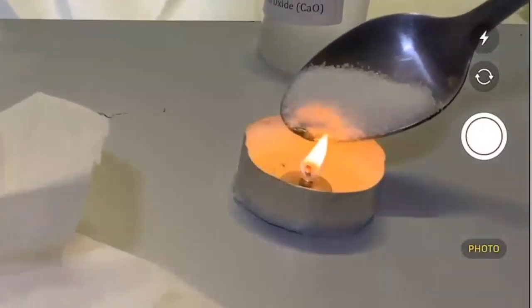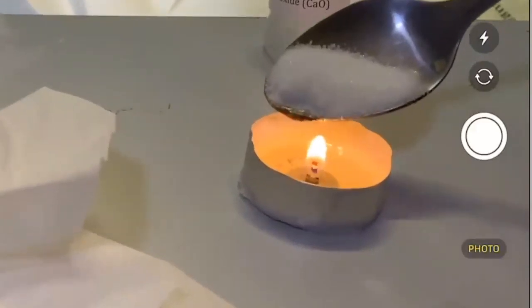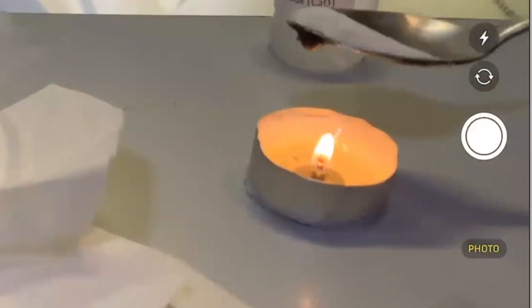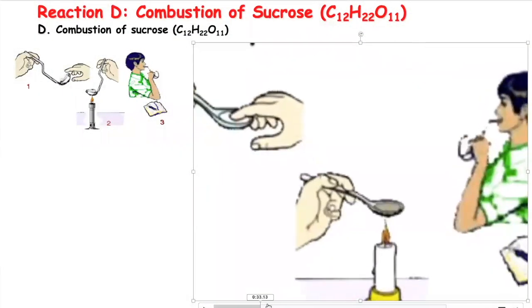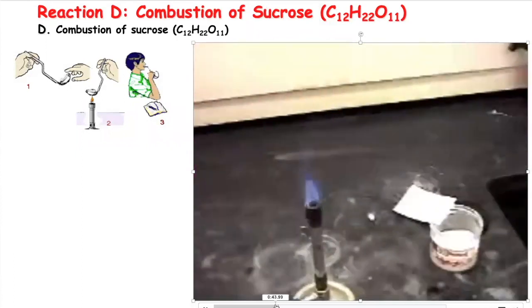It's not going to be a very big ignition, but you should see some sort of ignition. Let me show you the movie, because apparently my flame here is not strong enough for that. So here it is again. I'm going to scrub through. And here is the Bunsen burner.